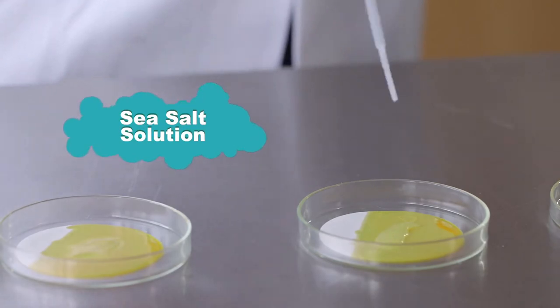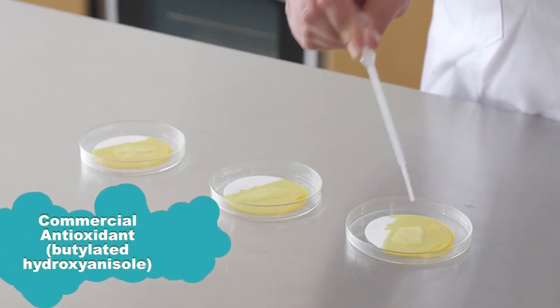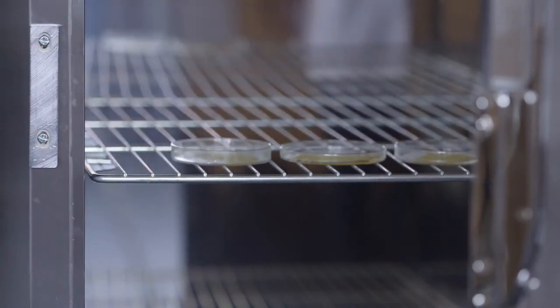Two, with a sea salt solution. Three, with a commercial antioxidant. In this case, BHA. Now place all of them in an incubator at around 40 degrees. Leave them for four to five days.